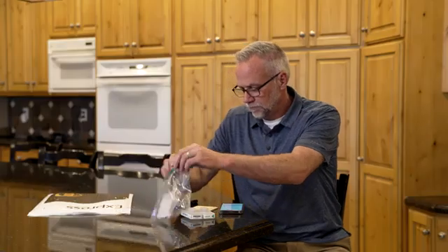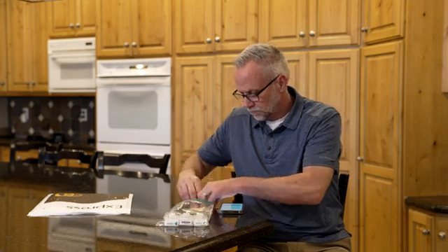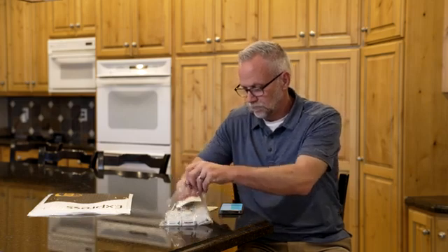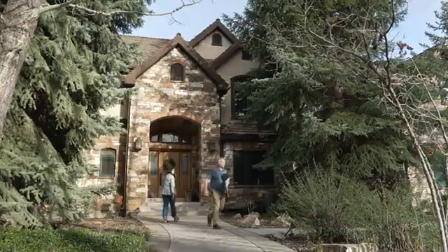Now, prepare the samples for shipping. You may use your own shipping provider and materials, or purchase shipping supplies from Sporecyte. Place all the samples and your order number from the app in a shipping envelope and ship them to our laboratory.